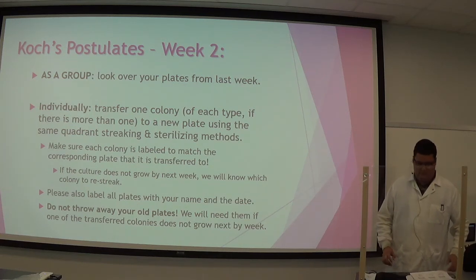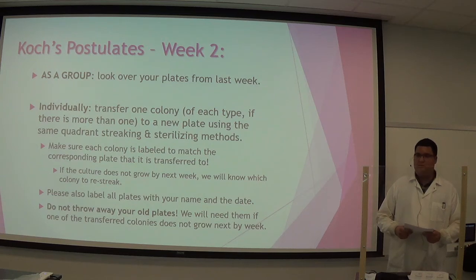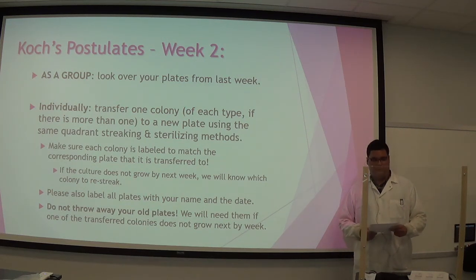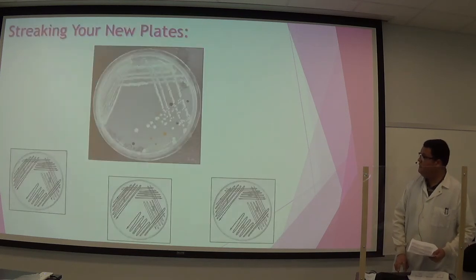On top of that, you will also be recording the symptoms and some of the signs of these infected plants that we have in here. That'll be for your assignment number 3, I believe. Yeah, assignment 3. So for you guys that are online, you will still have to do assignment 3, but we'll upload pictures of the things that we have here in the lab today. And I believe that's it.